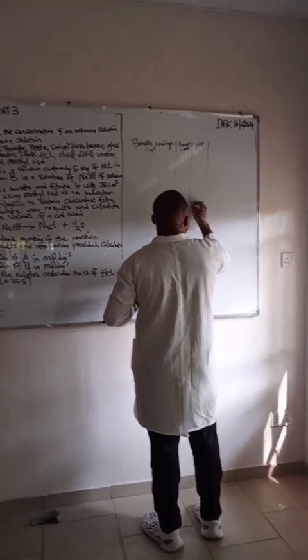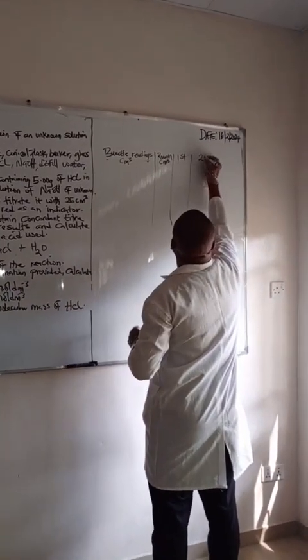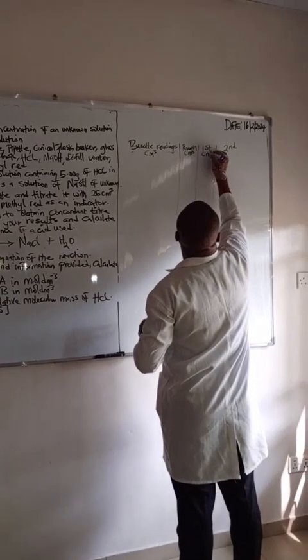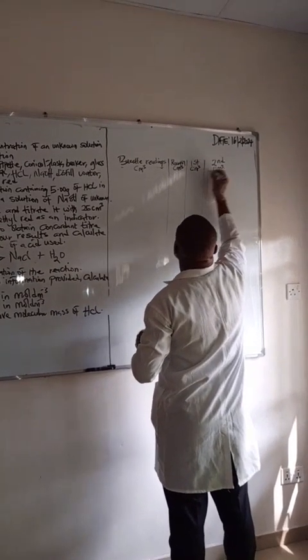This is our first titre, and this is our second titre, all in cm cube.